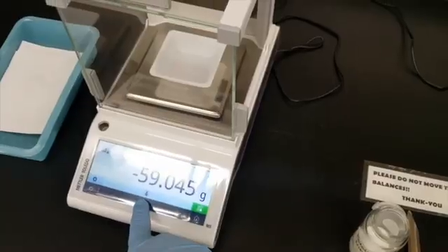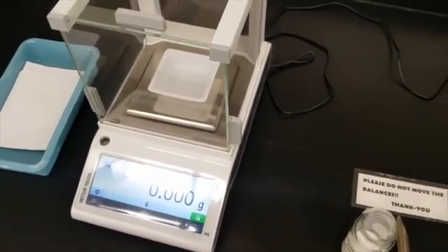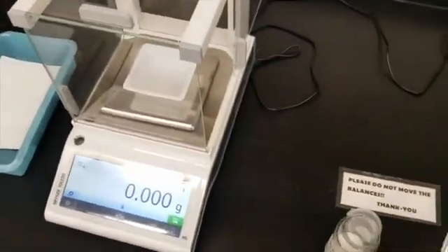So let's tare that. Oops, there we go. Now we're going to add our set amount of potassium nitrate here.